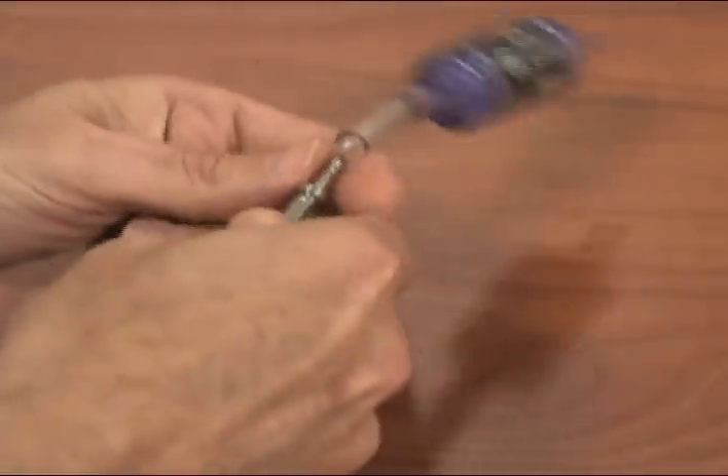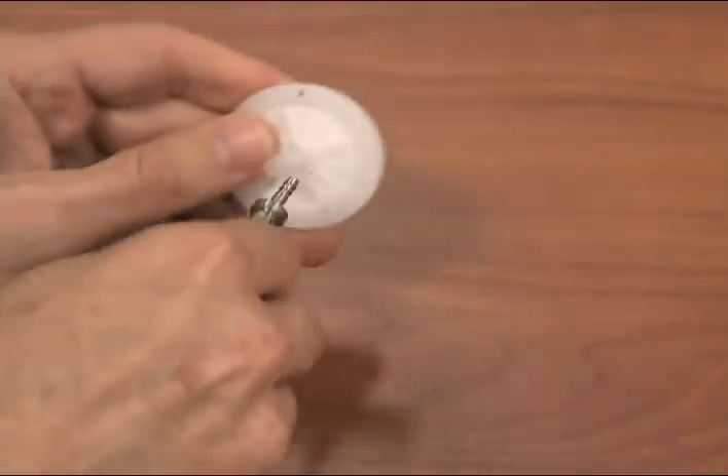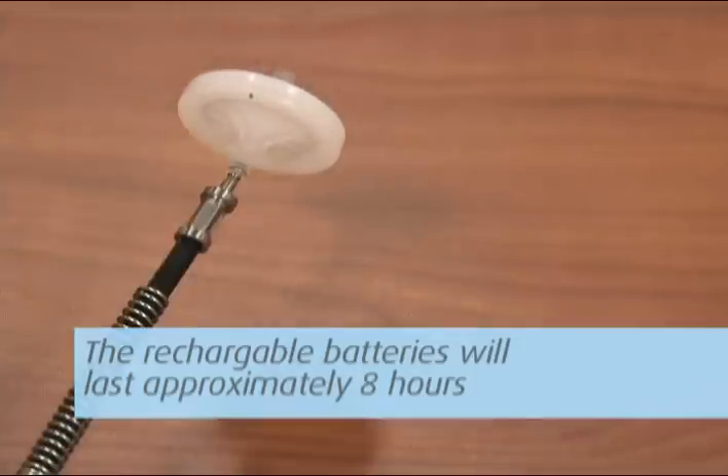Remove the zero carbon filter and install the water trap filter. You can now move from sampling point to sampling point to collect your data. The rechargeable batteries will last approximately eight hours before recharging is necessary.